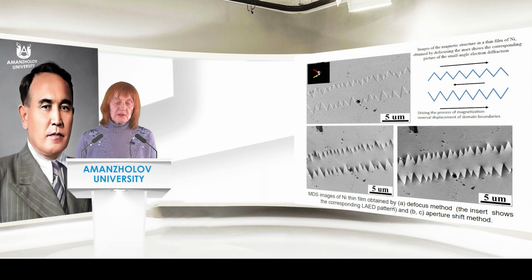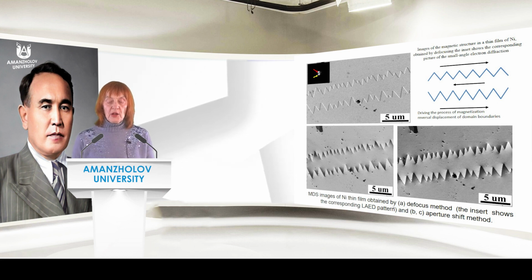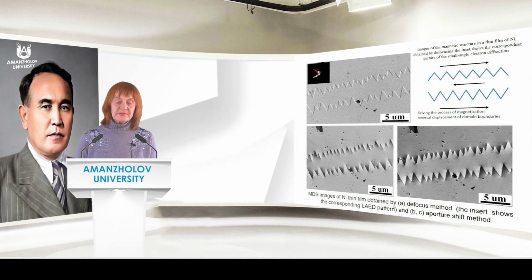The other picture shows magnetic domain images of one and the same area of a nickel thin film. The image is a magnetic domain image obtained by the defocus method. The insert shows the corresponding low-angle electron diffraction pattern.